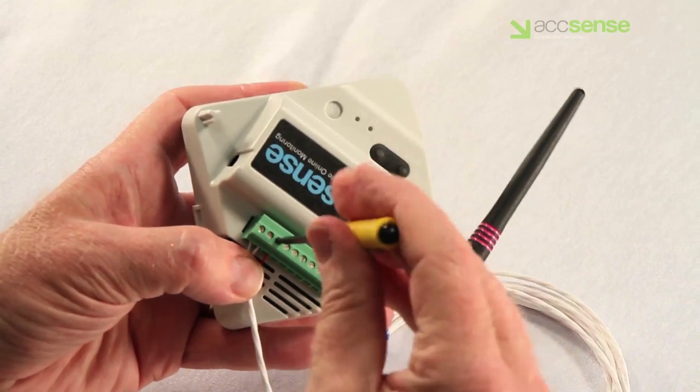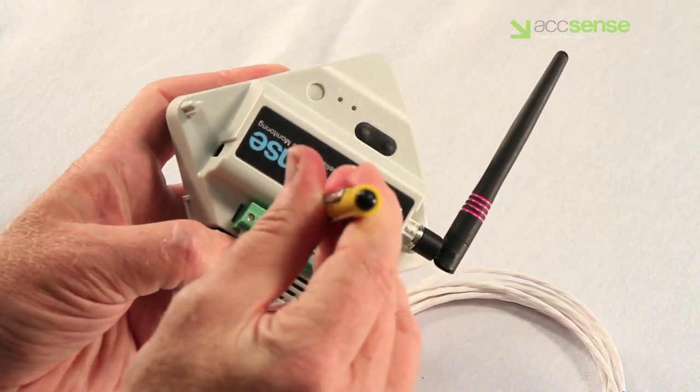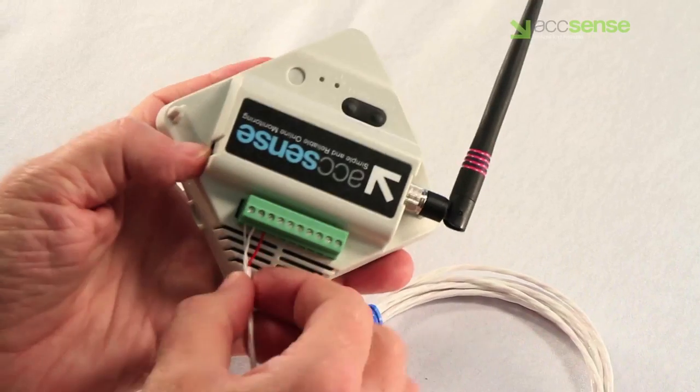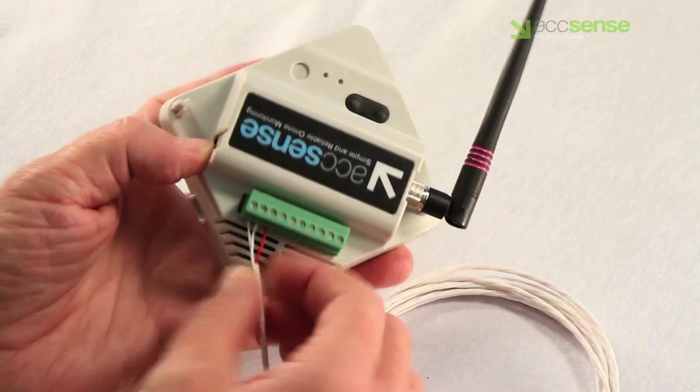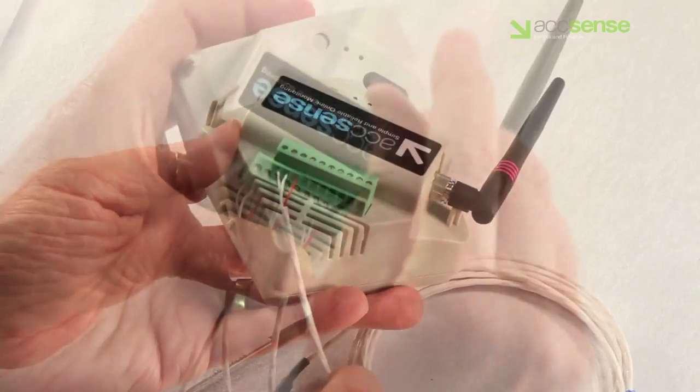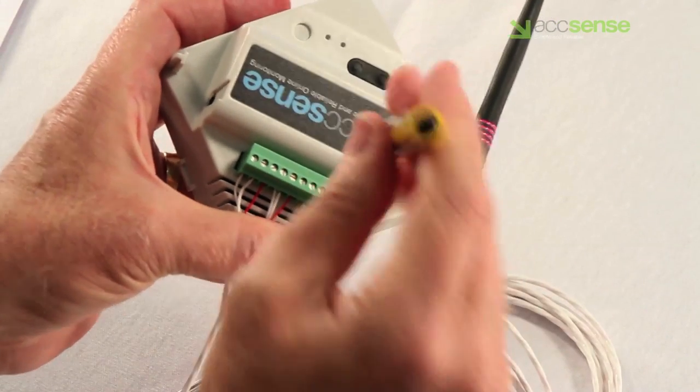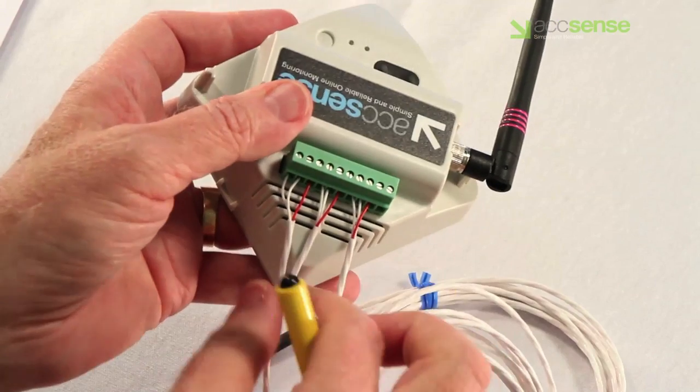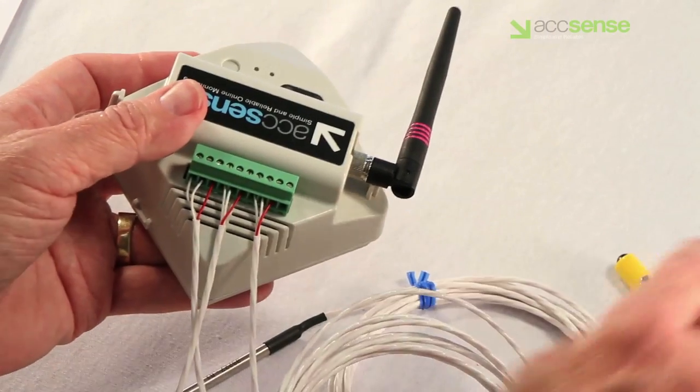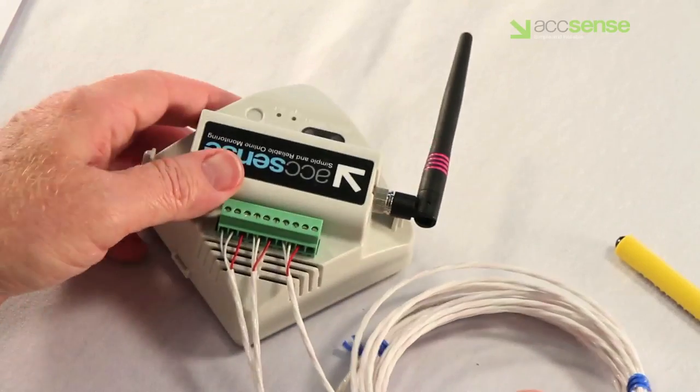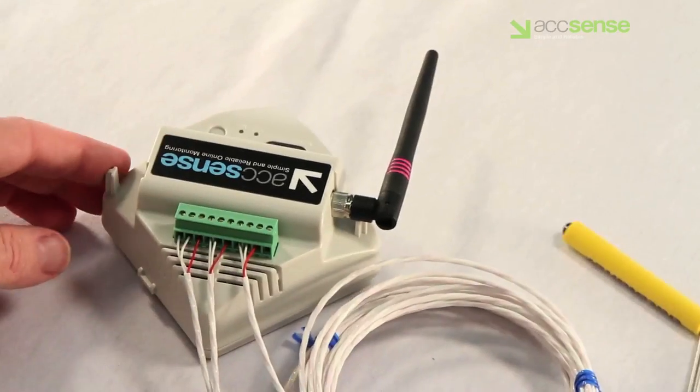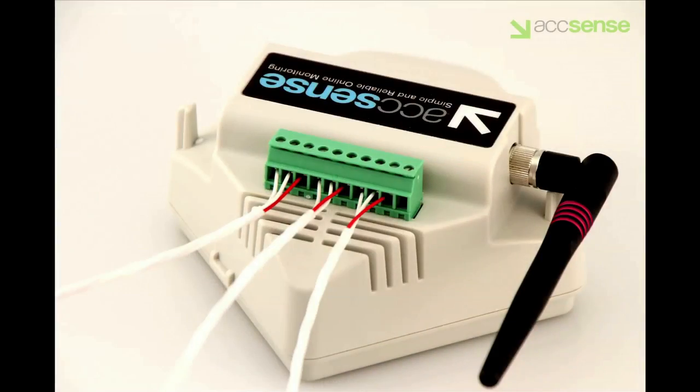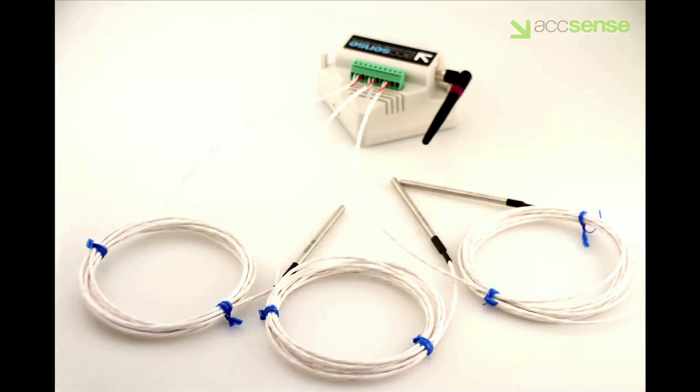Then pull on each wire to be sure that it is firmly fixed in place. Two more probes can be installed exactly as described before, except starting at pin 4 or pin 7. And the pod should look like this when everything is properly installed.